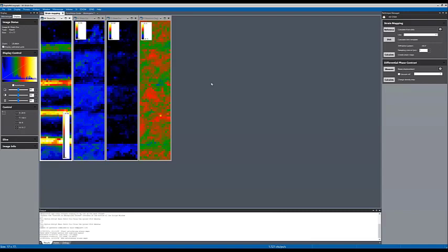Usually, for example, semiconductor people know there is no strain in the substrate. One other thing, if you don't define an unstrained area in your sample, then DM is going to generate the reference diffraction pattern from the full data set, and then compare each of the diffraction patterns in each of the pixels to that reference diffraction pattern.